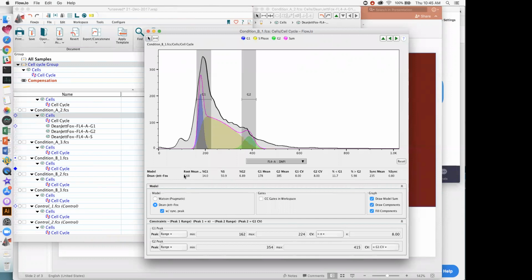You shouldn't take this RMS and say, oh, my RMS in this experiment is way better than the RMS that I had in another experiment, because you may have more events occurring in that second experiment than the first. Okay, so this is just meant as a guide here to tell you how well your model is fitting the raw data. Try to keep it low, as low as possible, and obviously, to some extent, the model has to match what you're seeing with your eye.